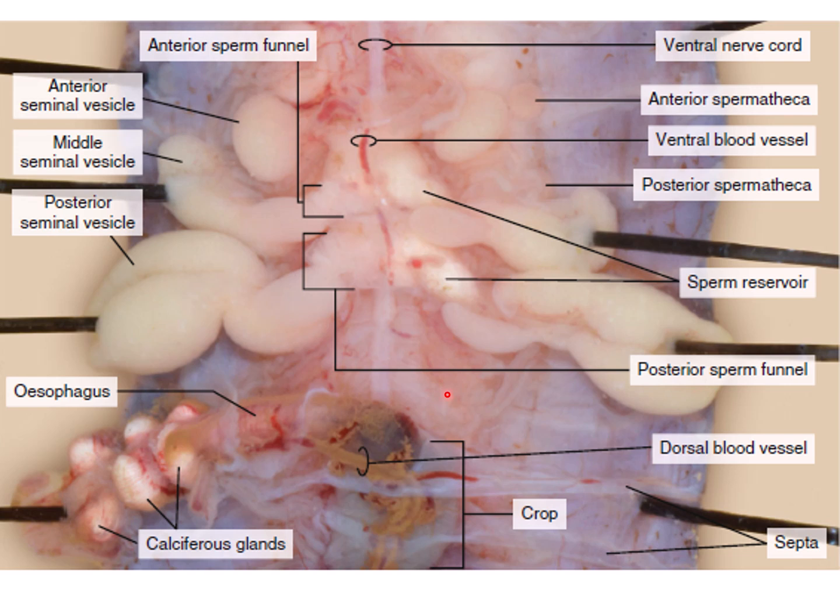So during mating, sperm from one worm travel along the seminal grooves to the spermatheca of another worm. Fertilization of the eggs takes place outside the body in the cocoon as it moves forward over the body, picking up the eggs of one worm and its mating partner's sperm from the spermatheca.